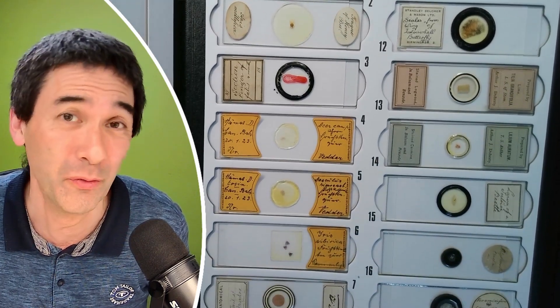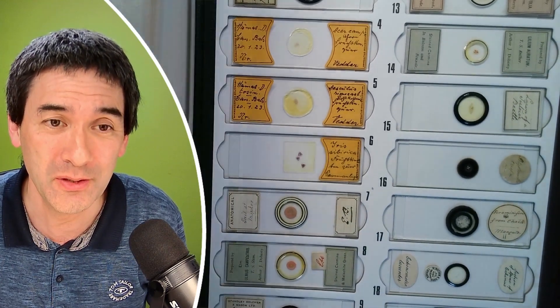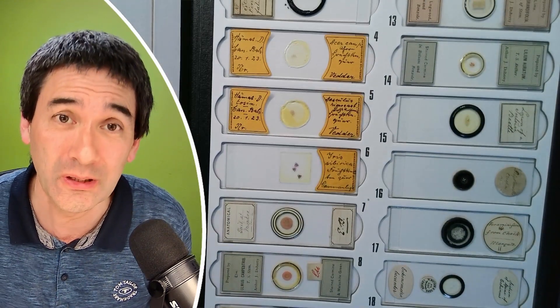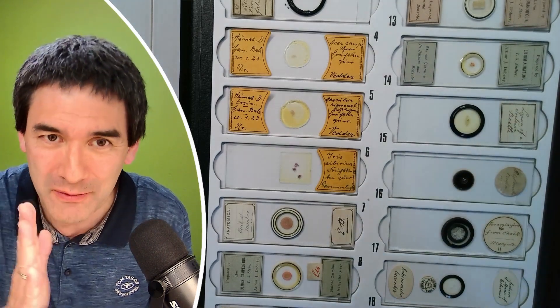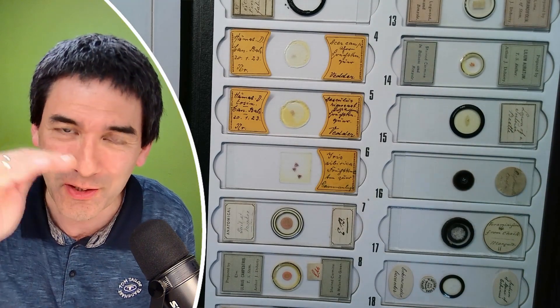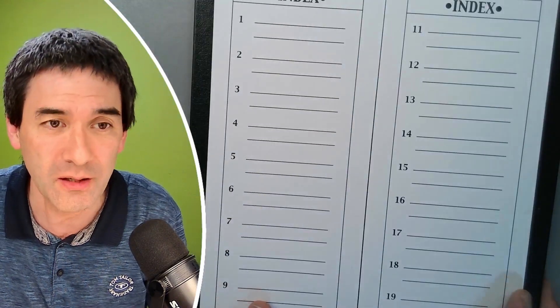I bought them over the course of several months. I put them into this cardboard slide box to store them horizontally. I could have also stacked them into a regular slide box and flipped it vertically so they're still stored horizontally. I've got actually two of these folders here.